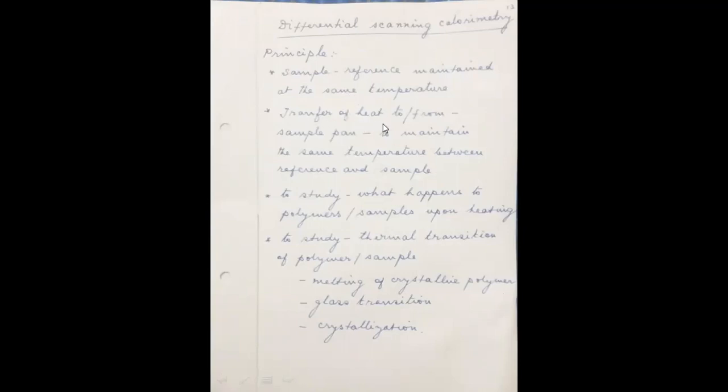So the transfer of heat to the substance or from the substance is made to maintain the same temperature between reference and the sample. So that is the principle.